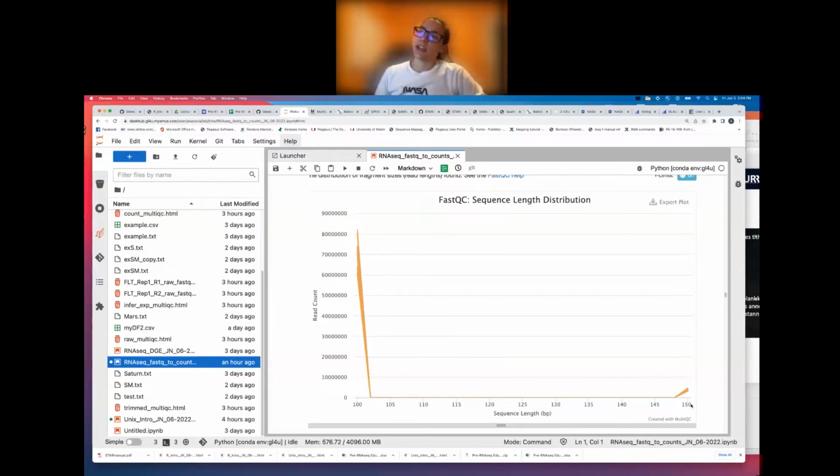So what actually happened here is these samples were sequenced before we had a sequencer at GeneLab. So we actually outsourced these samples to be sequenced at UC Davis. We told them the read depth that we wanted per sample, and we wanted to sequence it originally at paired end 100 base pairs. So they sequenced all of these samples at paired end 100 base pair and gave us back our data. This was before I joined GeneLab.